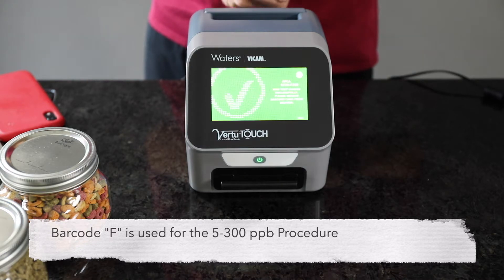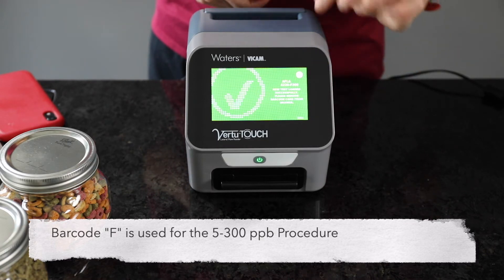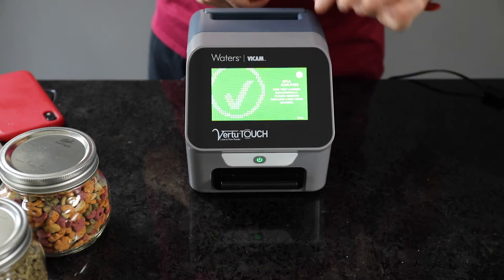Once the calibration barcode is scanned, the Virtu Touch will automatically store the calibration for future use.